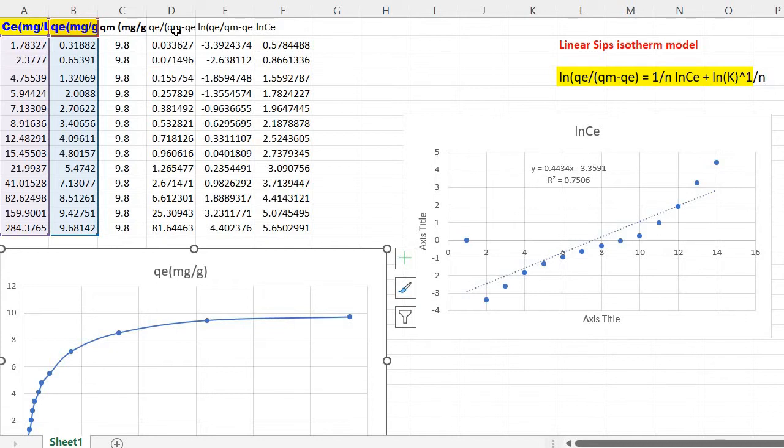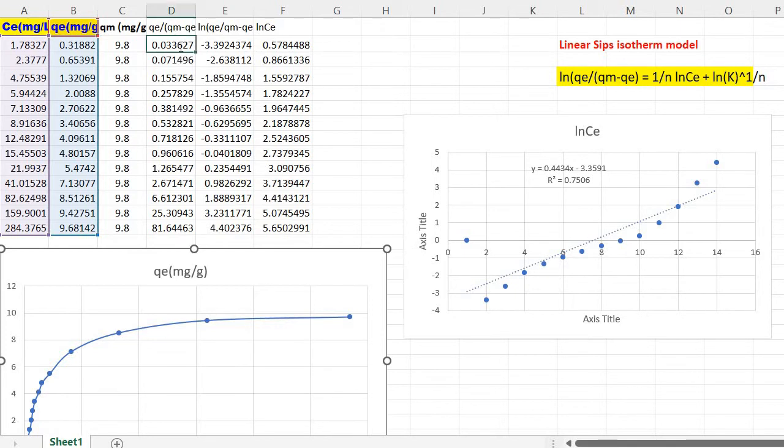Then you need to calculate QE divided by QM minus QE. Just write equal to, then click on this. Click on this B2, QE divided by bracket C2 minus B2, then bracket, then click enter and scroll down this.